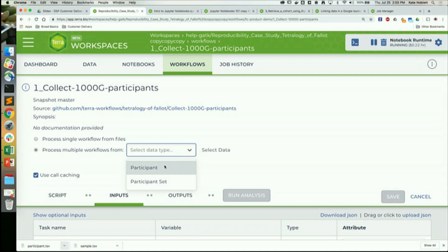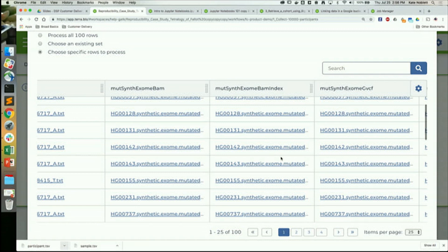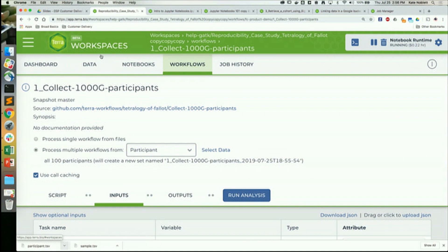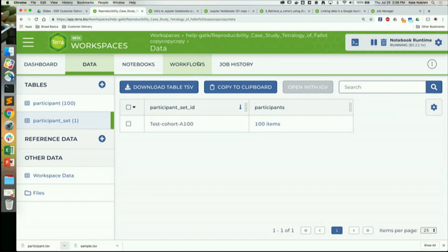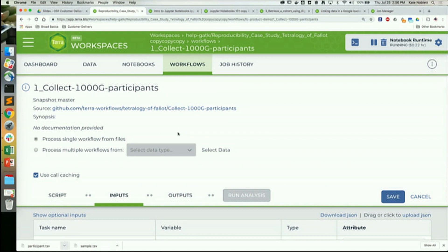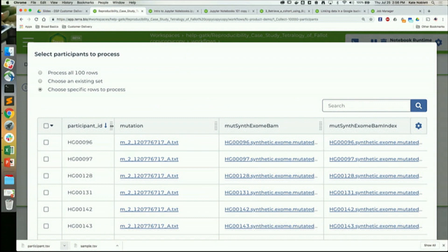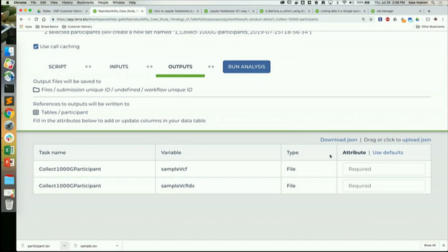We're going to select participant, choose specific rows, and click just the top two. Before I do, note that right now there is one participant set called 'test cohort A100'. When I launch this workflow, we select what we want, click OK, then look at outputs — the attributes are empty right now so I'll click 'use defaults' and save.